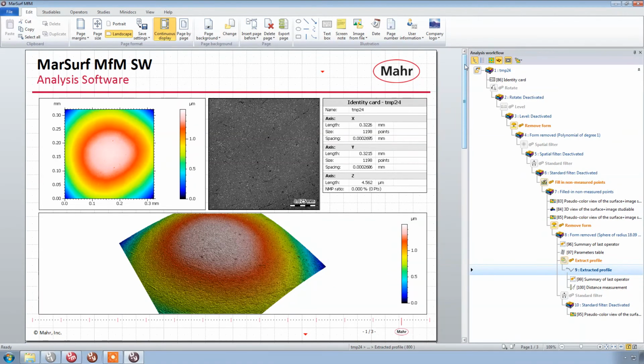Here is my other mirror polished perfect sphere that's not really a mirror polish or a perfect sphere again. The first thing I noticed when I measured this part was, if this were a perfect sphere, this ring pattern would be a circular ring pattern instead of a concentric potato shape pattern. That indicates that we're just not spherical. The part isn't very spherical.